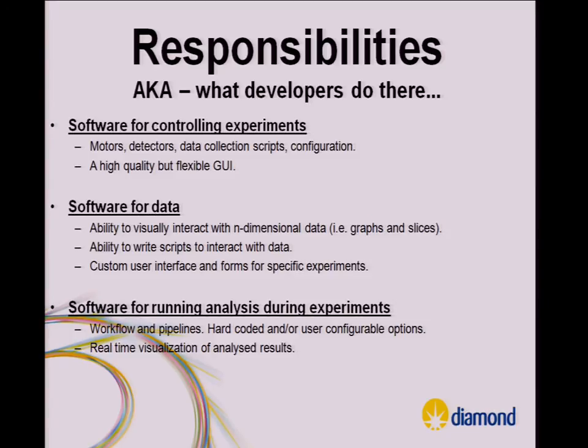The GUI doesn't save the data, we've got a server for that, but it interacts with the server. And finally, it's the middle one actually that I'm talking about now, is we've got software for data, which is an Eclipse workbench we're going to have a look at. Basically it's going to plot arrays of numbers and allow people to do mathematics of some description, and the description is quite varied, so we have to be very flexible in what we do.